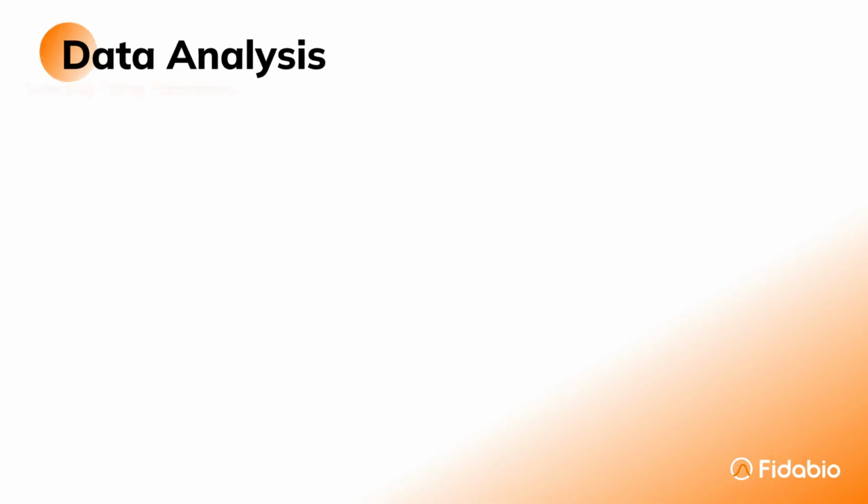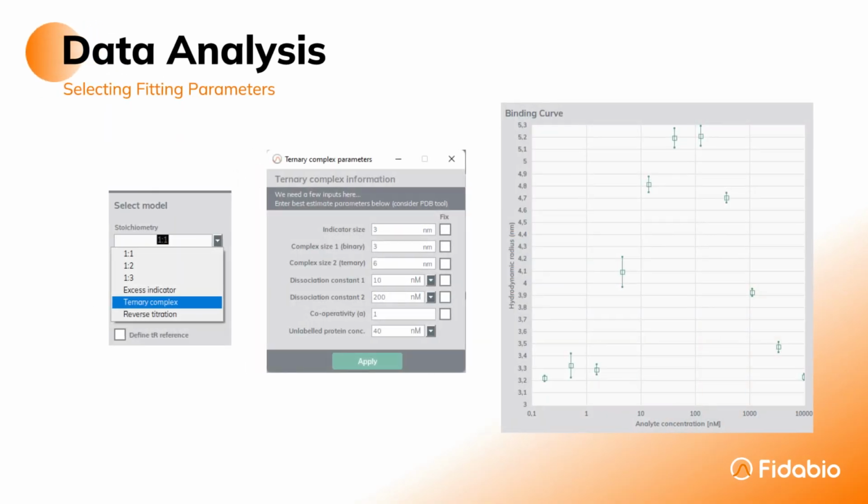To fit the data, you have to select the ternary complex model in the Select Model tab. When you do, you will see a pop-up asking for a few initial guesses for the parameters. The size of the indicator should be set to the data point at a concentration of bispecific molecule of 0 micromolar. The binary complex size is the end of the titration curve. The size of the ternary complex is the top of the titration curve. KD1 and KD2 should be set to the half point on either side of the top point of the curve.